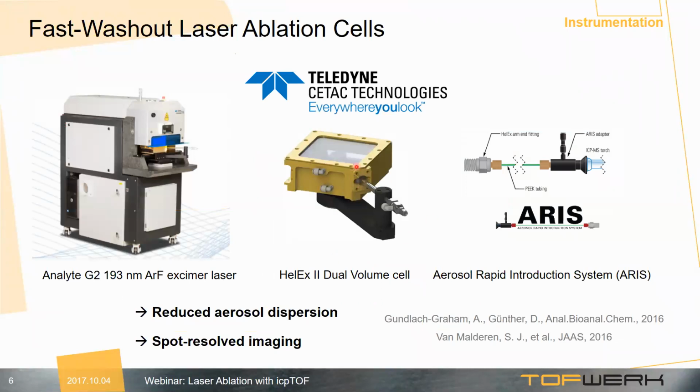All right, now let's talk about the fast washout laser ablation cells. This is actually something that a lot of laser ablation companies work on these days, not just Teledyne CTEC, but also other companies like ESI, New Wave, or Australian Scientific Instruments, ASI. But I'm just showing the Teledyne CTEC equipment here because that's what we have in the lab, and most of the examples that I will show use this equipment.